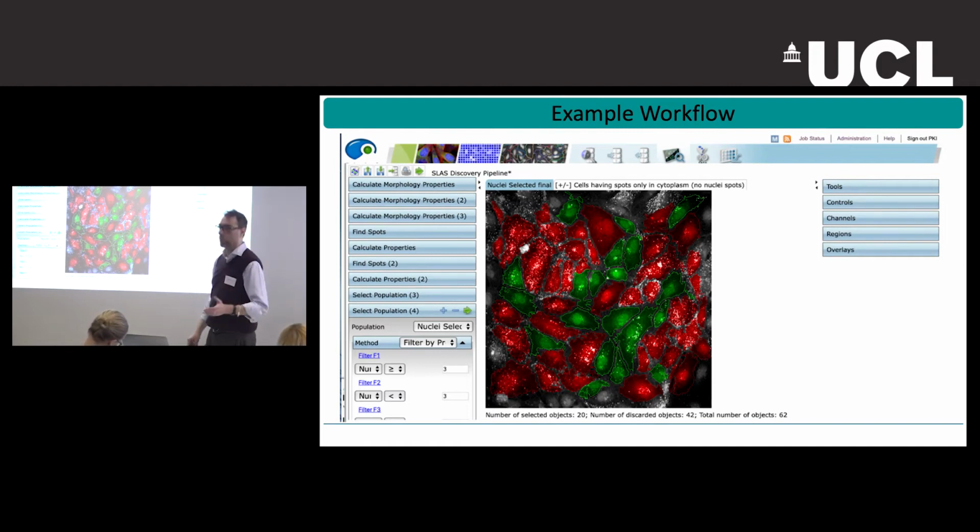If you want to use CellProfiler, you can do similar things. Harmony can do similar things. So it's just a choice of what you do. The advantage, for example, of using Columbus or Harmony, if you work with Davide, is that everything is already in a huge data store that can be easily accessed. In other contexts, you just have to have your big data storage connected to the computer where you have the software that you play with.